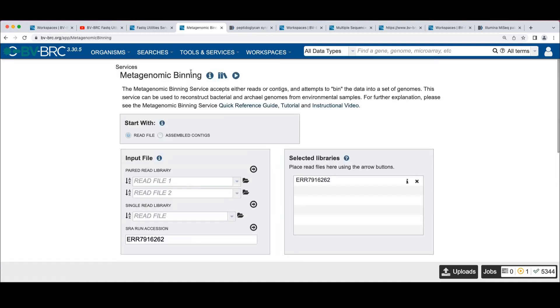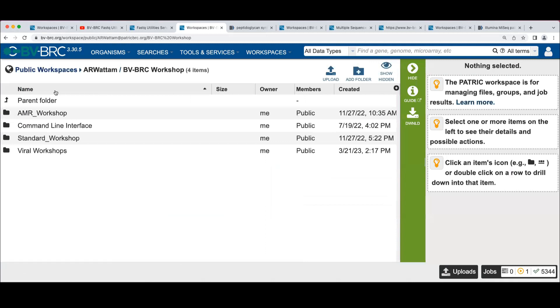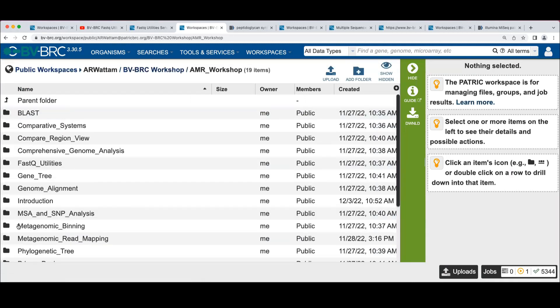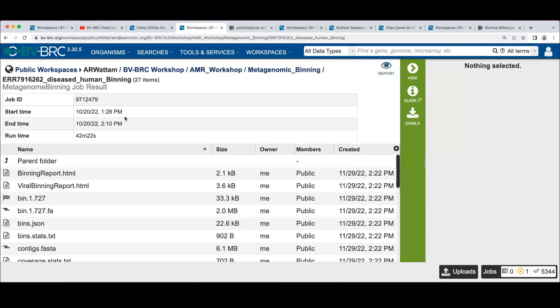All right. So let's look at the output of this. Oh yeah, I was supposed to call it diseased human binning.